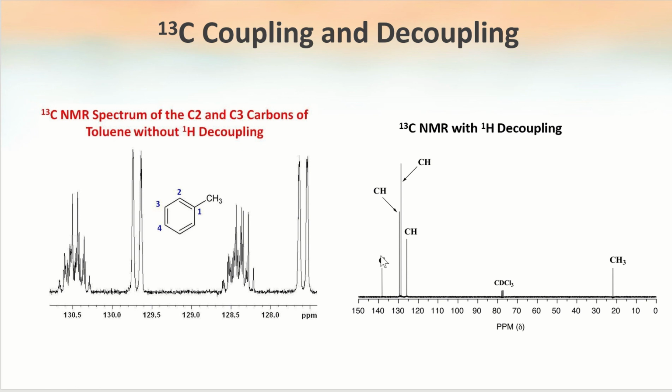We have our quaternary carbon here, and our aromatic carbons, sorry, carbons here. This is a carbon-13 spectrum, so we only focus on the carbons in this spectrum.